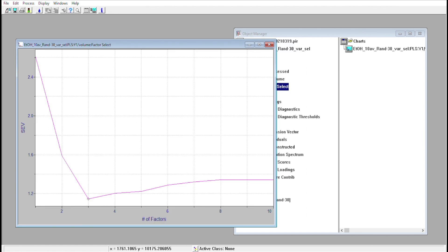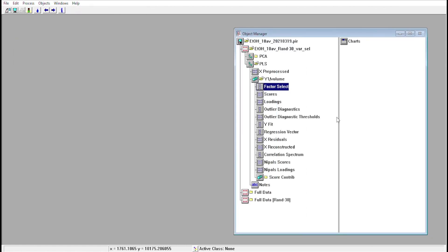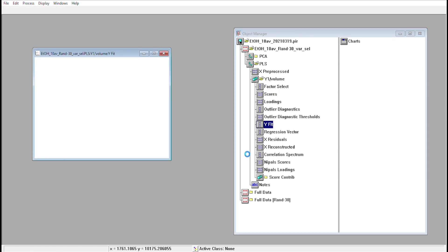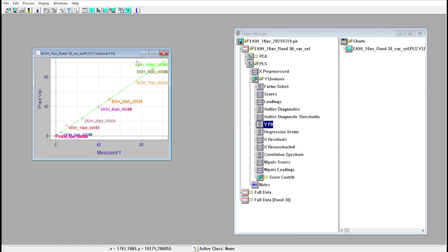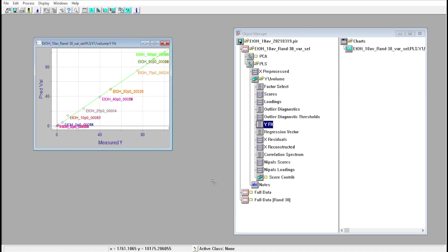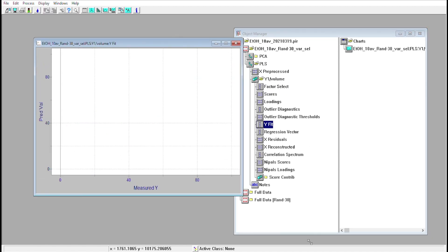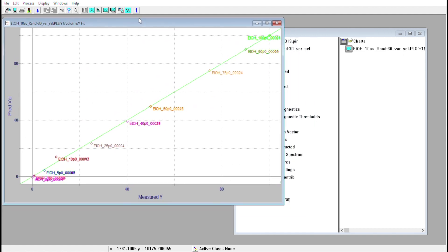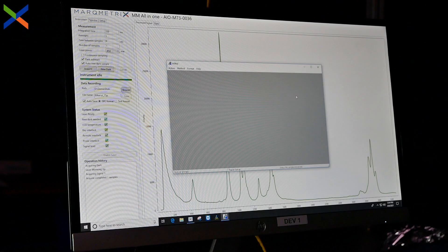To build the model, we take the calibration data we collected earlier, set the relevant parameters in Pirouette, and the software takes care of the rest. Now we can save the model so that we can test its validity with our known samples.